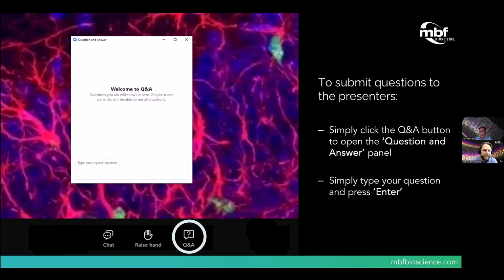See another question here about the image formats. The raw data, we actually use a raw data format. Our final image format is a JP2000 format. That's a great format to use.